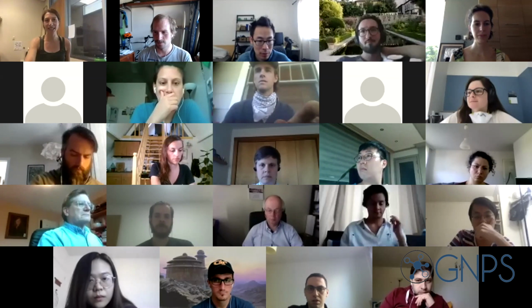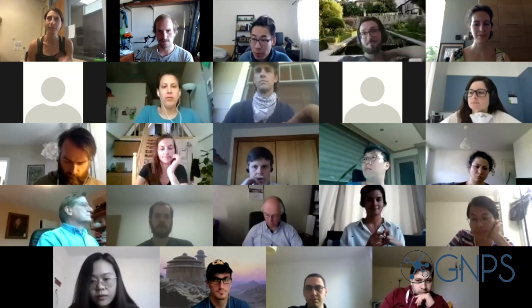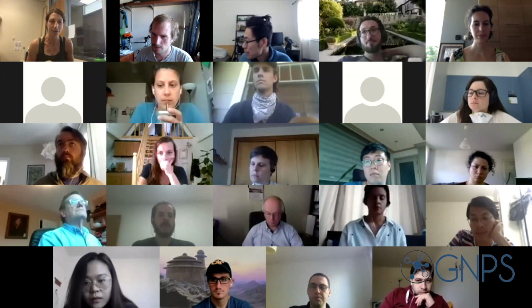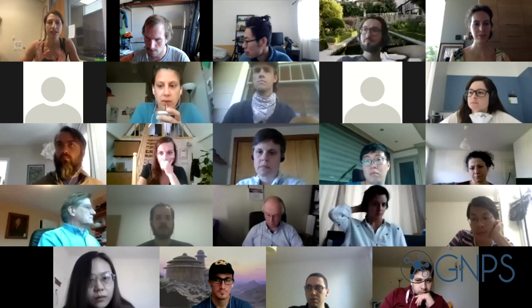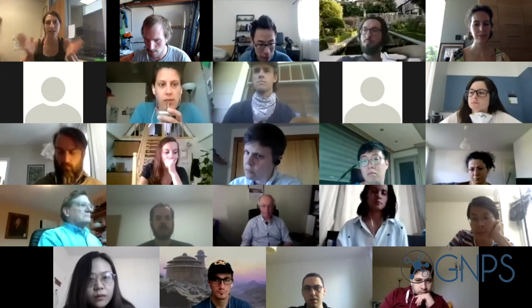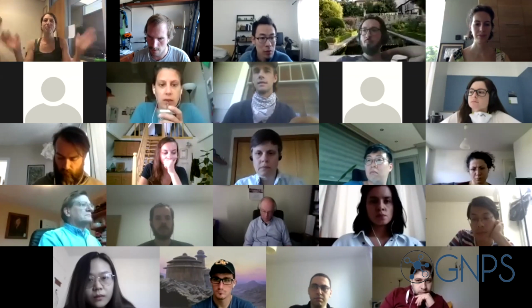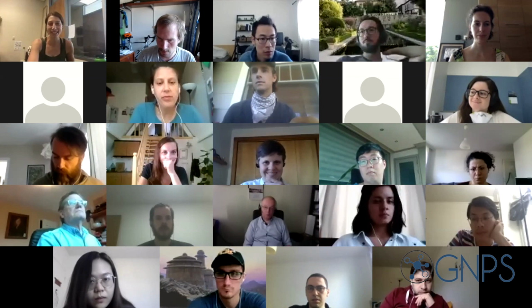So hi, everyone. I think most of you hopefully were at the previous two workshops on feature-based molecular networking, because now we're going to turn to the hands-on activity where we're actually going to look for those new and previously known siderophores. We've been working up from last week to this point. So hopefully you are excited.